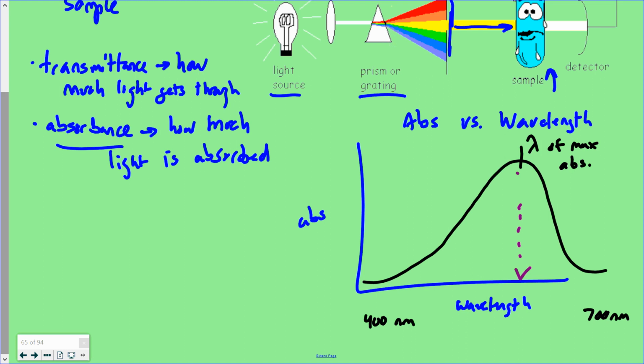The electromagnetic spectrum heads from over here in 400 nanometers, violet light and indigo light down over here, then to blue, then green, then yellow, and then orange, and then finally red, all the way out to 700 nanometers, just like Roy G. Biv, but in reverse.